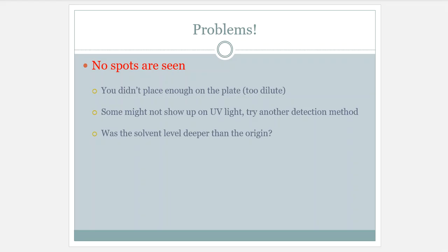So again, problems. As well as you know, on the tests and the quizzes, I'm going to ask a little bit about troubleshooting. What could have happened to make these problem situations a thing? And how would you go back and how would you fix them?